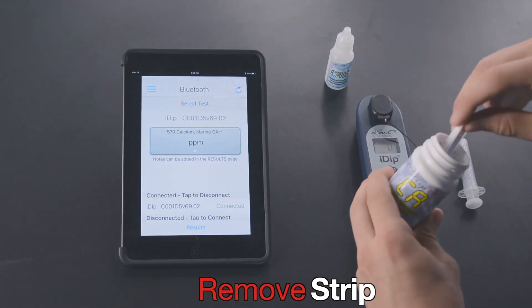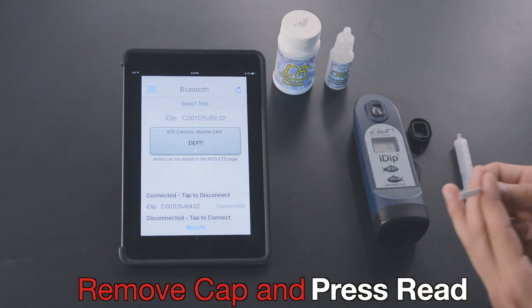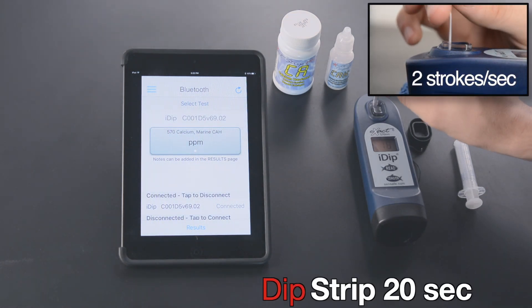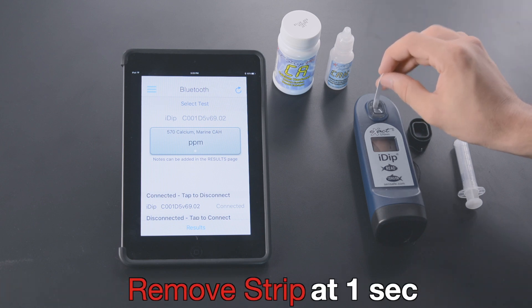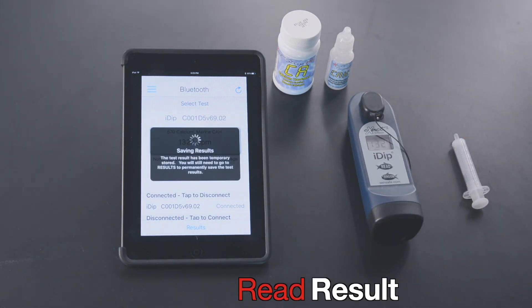Remove strip. Replace lid on bottle. Remove cap and press Read. Dip strip 20 seconds at two strokes per second. Remove strip at one second. Replace cap. Read result.